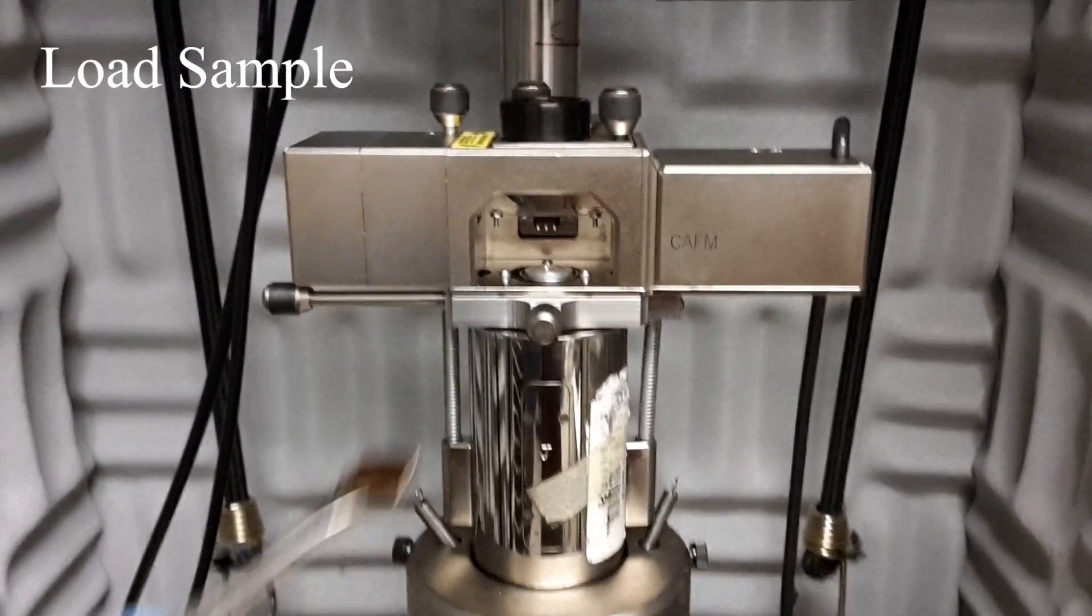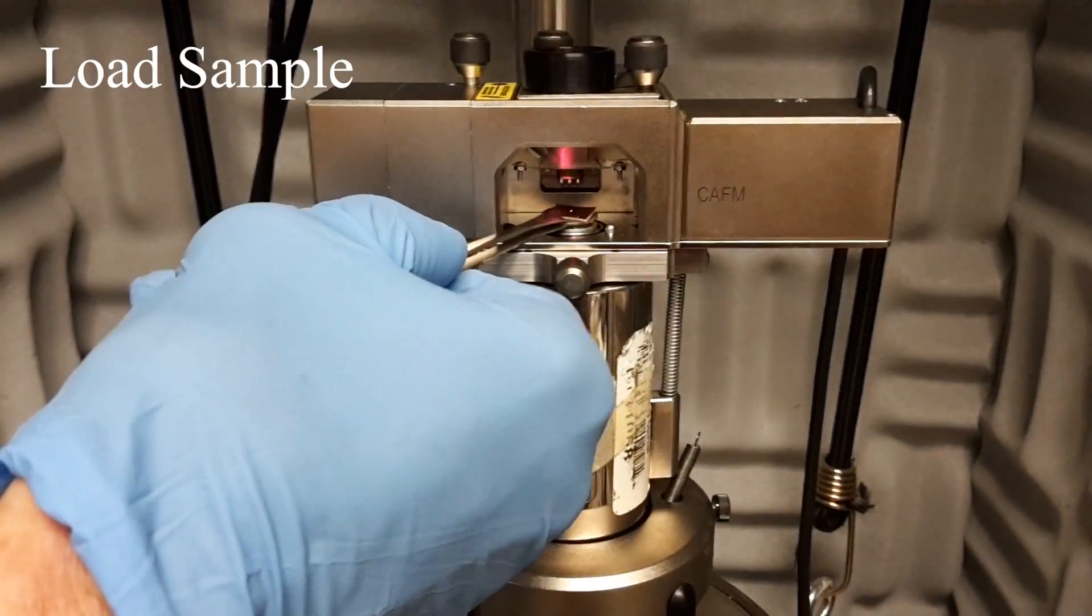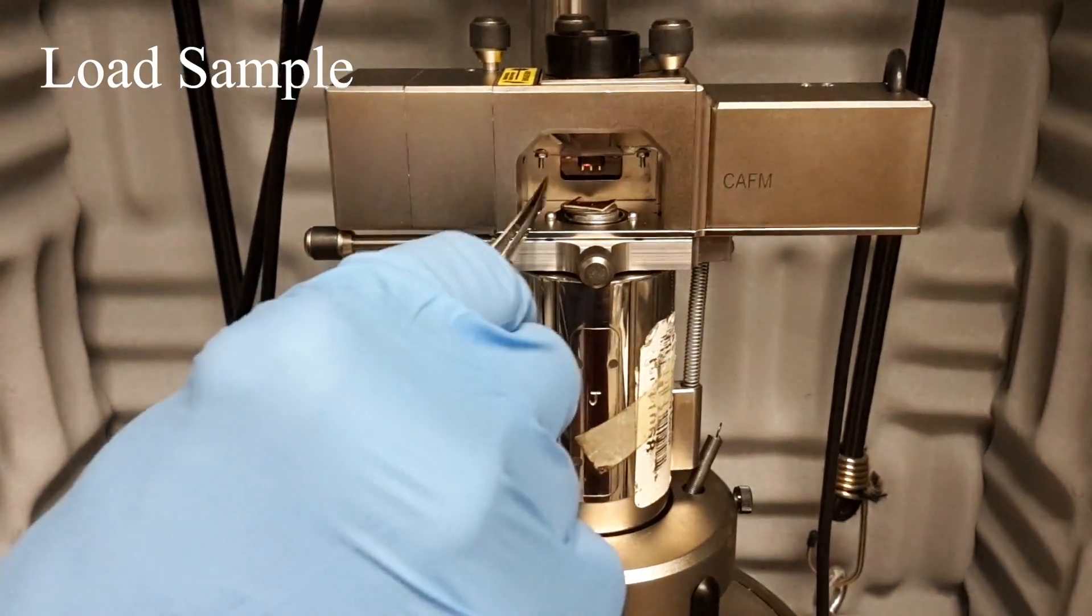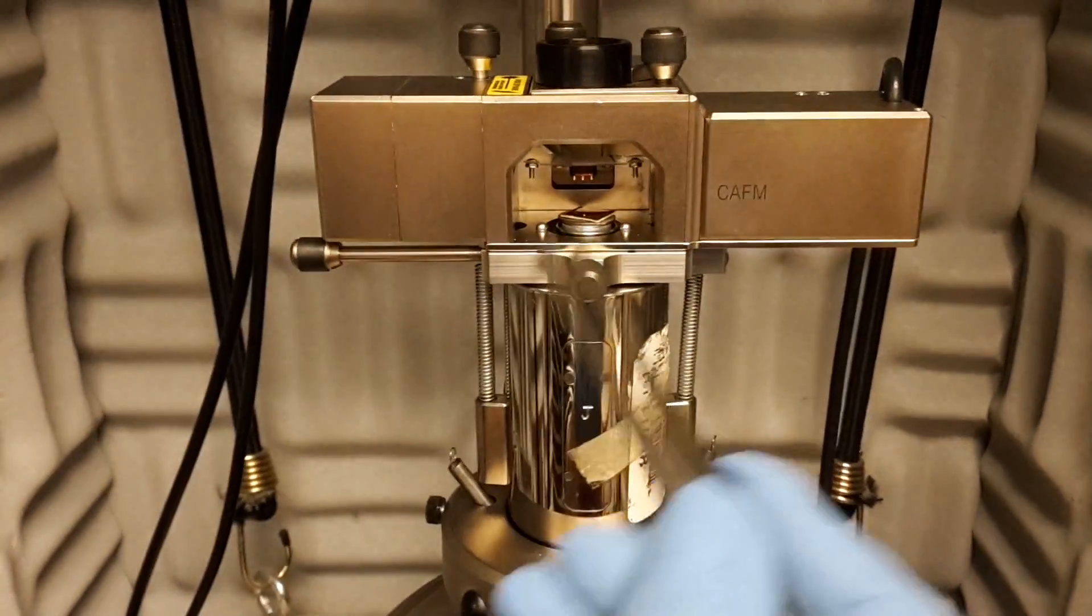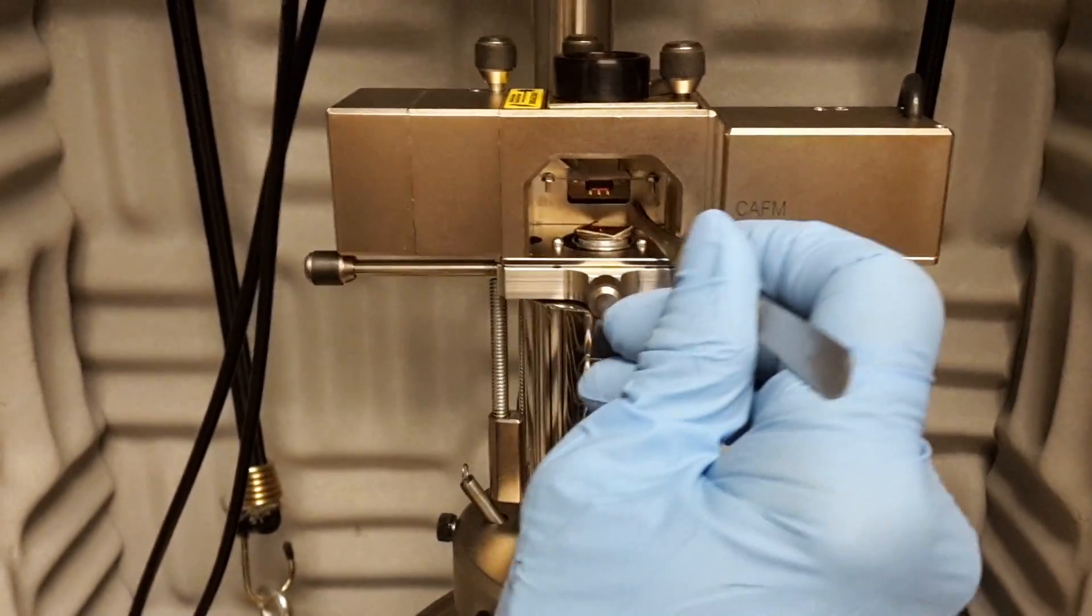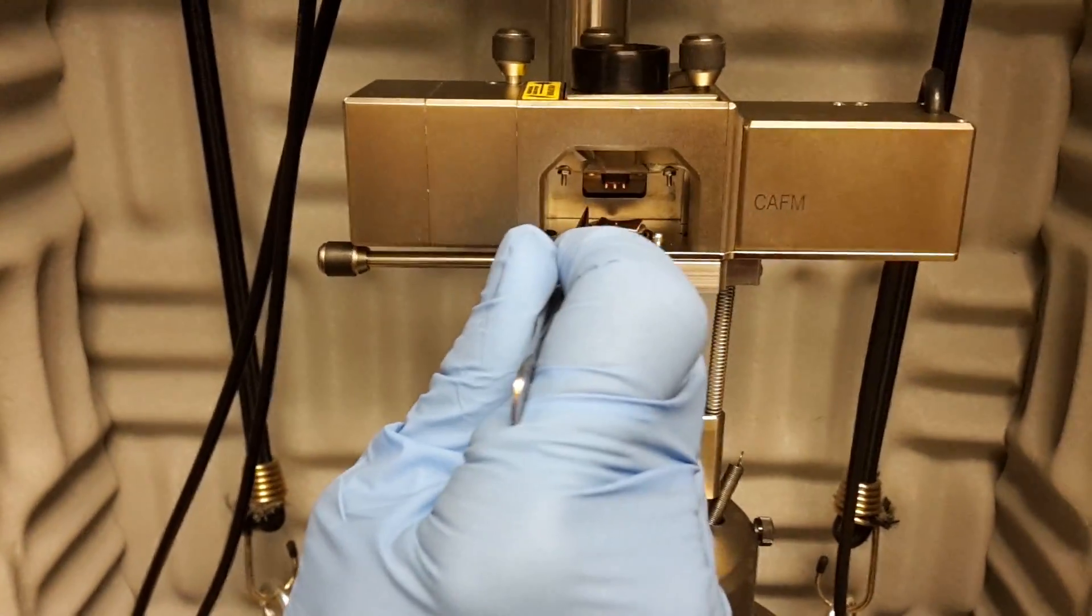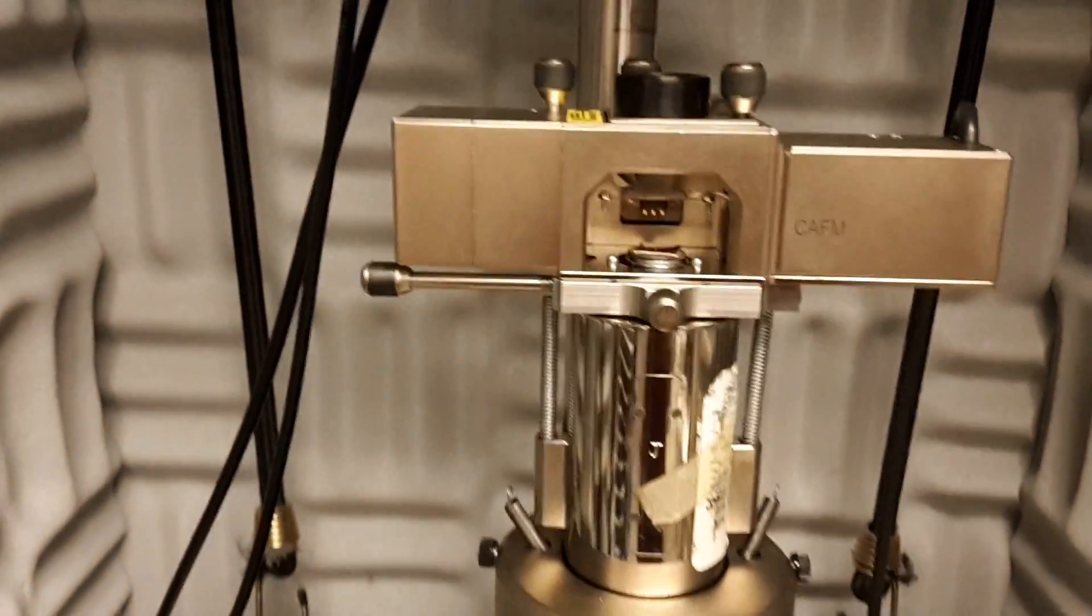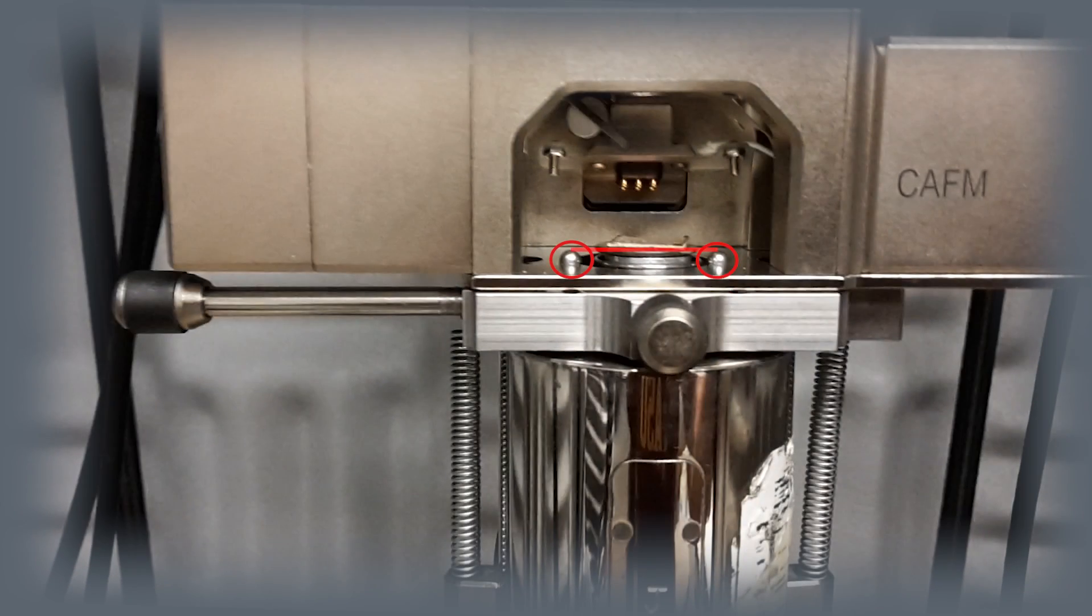Using the flat nose tweezers for a secure grip, position your sample at the center of the magnetic stage of the scanner. Push towards the center using your tweezers if necessary. Check the height of the sample in relation to the two positioning pins on the floor of the optical head.